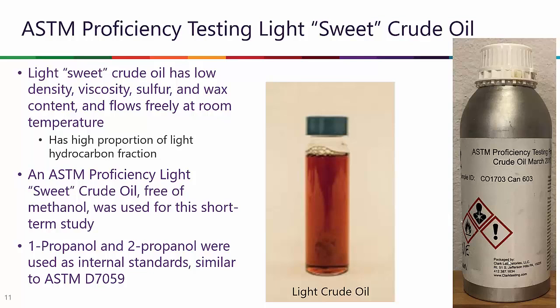So, of course, for this proficiency study, we had to check to make sure there's no methanol, so this was methanol free, and we also used 1-propanol and 2-propanol as internal standards since it's similar to ASTM D7059.